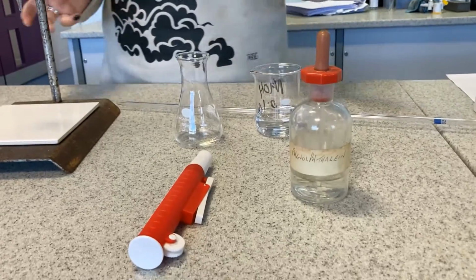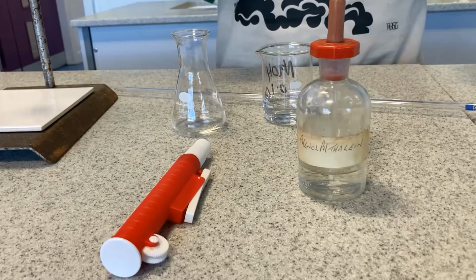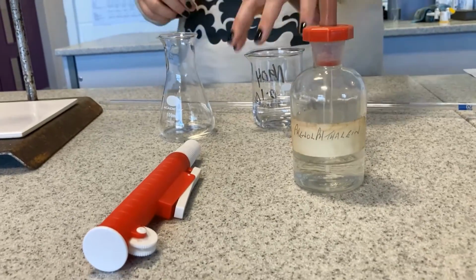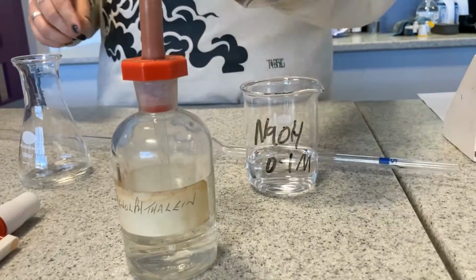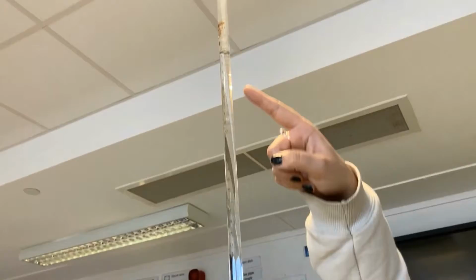All right, boys, so today we're going to talk about titrations. Titration is an accurate way of neutralising an alkali and an acid, okay? So we've got a large amount of acid in this contraption, which is called a burette, okay?